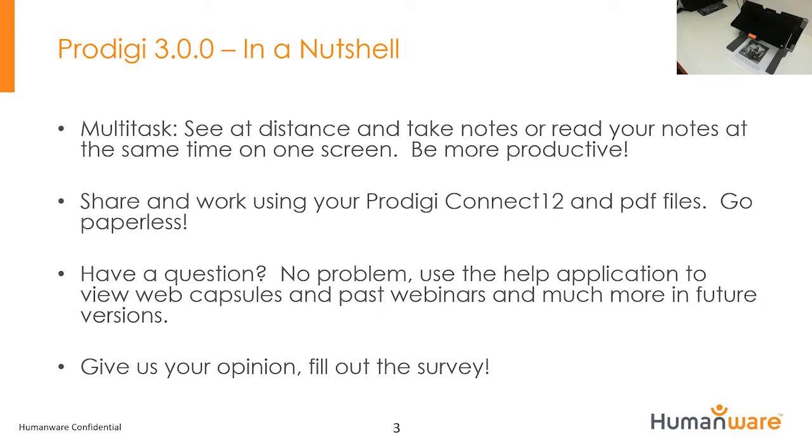Give us your opinion. In the help application, there's a new survey. It's about 5 questions usually on the current Prodigy version. And when I say Prodigy, it's the software version on the Connect 12 or the Mat Connect. So I ask 5 to 6 questions on the current version to get the user's opinion, which is really, really important for us to see if we did a good job, and also to address situations that were not resolved.